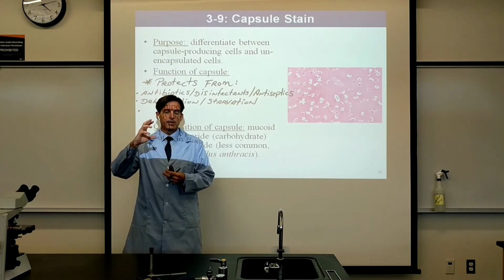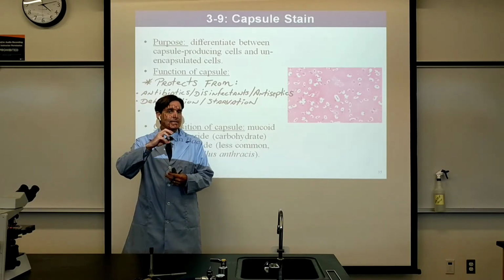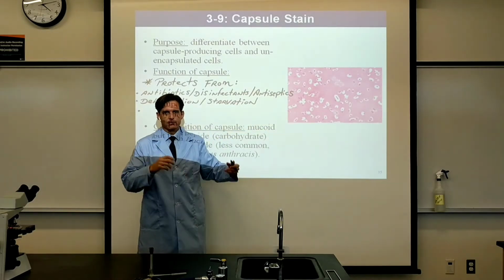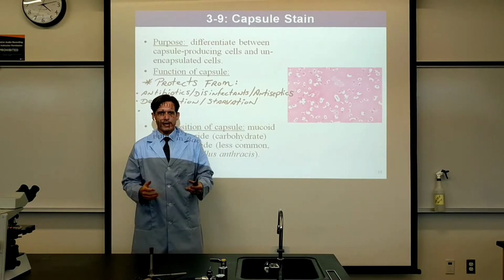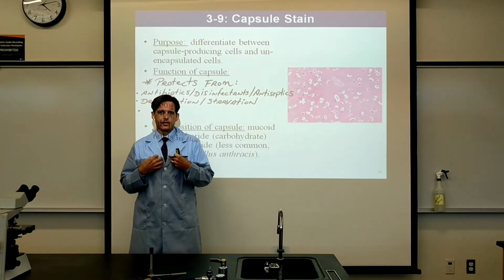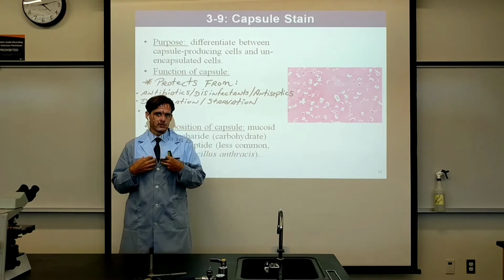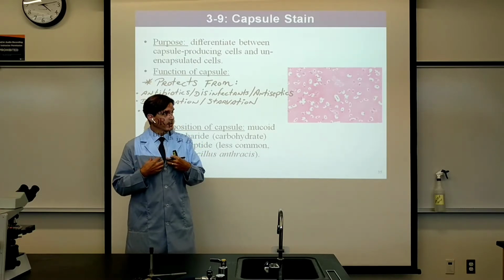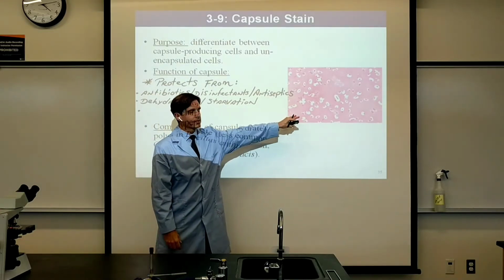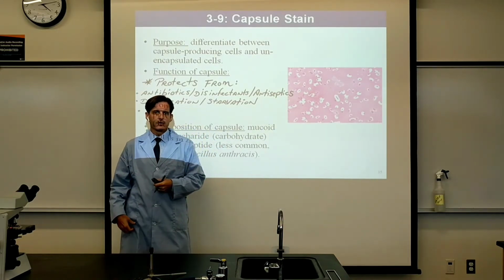Phago means to eat, and cyte means cell. And these are white blood cells that will eat little bacterial cells and fungal spores and viruses and whatever the phagocytes can get a hold of. And the ones that are specialized that live in the air sacs called alveoli, those alveolar air sacs have the phagocytes called macrophages. So alveolar macrophages are the white blood cells that would normally eliminate these kinds of Klebsiella pneumoniae cells.